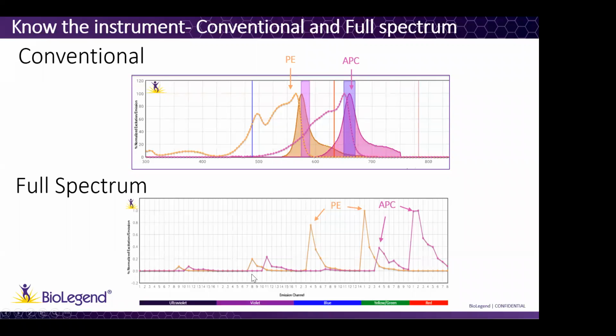So then these photons that we collect, we gonna get this kind of spectral signature. And then if the signature is different enough, we can resolve these different fluors. So for instance, here you see the PE. So there is some blue laser that you have a conventional maximum peak here, but then you also have a lot of signal in yellow green, whereas the APC is on the red laser, but then you can also see a peak here in the yellow green. So there is a little overlapping.